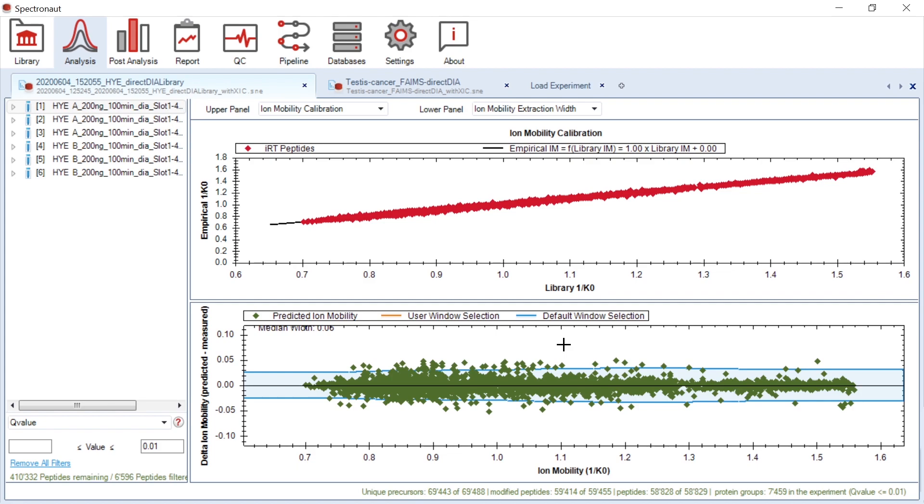The ion mobility extraction width plot shows the difference between predicted and measured ion mobility in function of ion mobility value. In blue color, you could see the extraction window that was applied for your data.